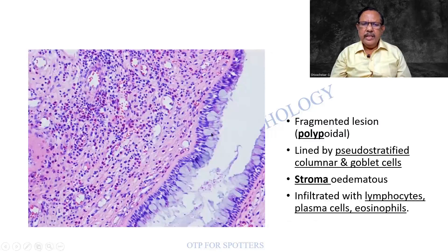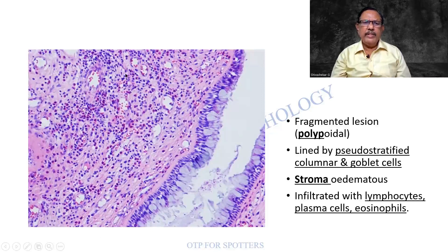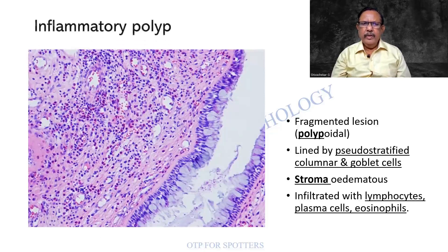This is another lesion which is lined by tall columnar cells. There is pseudostratification and there are some goblet cells present. The stroma — stroma means the connective tissue — is edematous and is showing a lot of inflammatory cells. I would like you to mention the cells that you find in the slide in your college. Usually lymphocytes, plasma cells, or eosinophils can be seen. The diagnosis is inflammatory polyp.